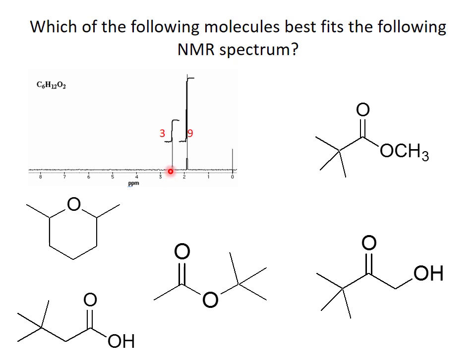Well, if I look at this methyl, it's farther downfield. Which would be farther downfield, attached to a carbonyl or attached to an oxygen? Well, attached to the carbonyl would actually be farther downfield, because not only do you have the oxygen being electron withdrawing, but you have the pi bond there. And the methyls in the T-butyl group are not directly attached to the oxygen, they're on the carbon that is attached to the oxygen. And so this is the structure that best fits.